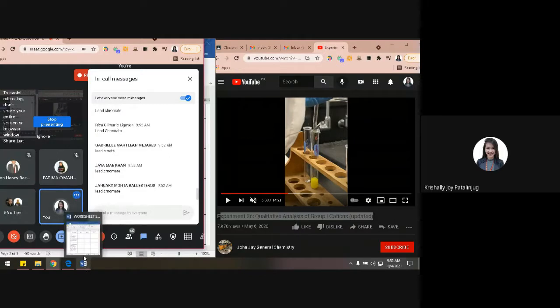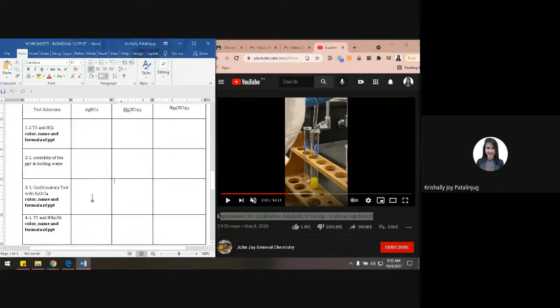So, yan lang. Okay, very good. It's a lead chromate. You will know easily by just looking at the reaction. Dapat yung mismong precipitate, nandoon yung ion na gusto mong i-precipitate, followed by the anion. Kasi cation na to. Dapat partner niya is the anion, the chromate. So lead chromate is the name of the precipitate here.